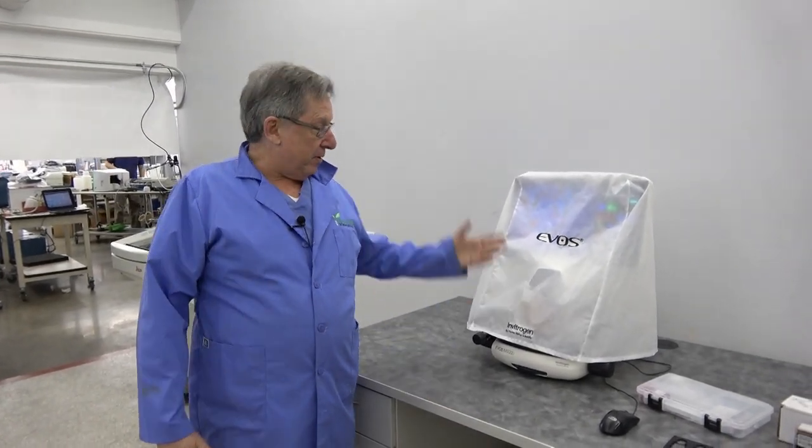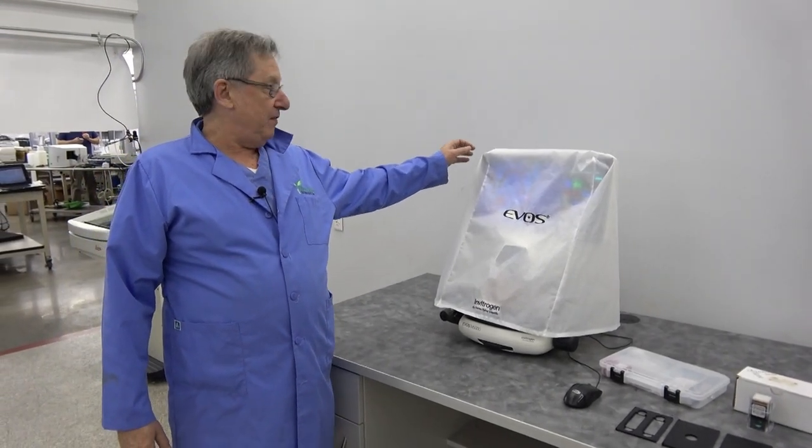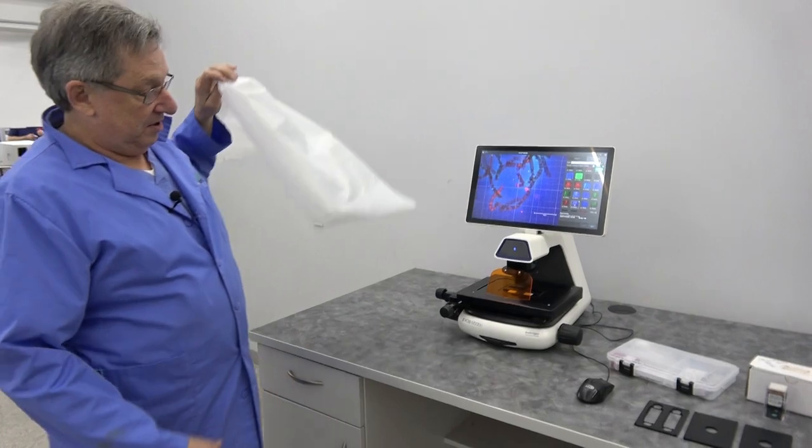Hello! Welcome to New Life Scientific. My name is Steve. Today we're going to show you a little bit about the EVOS M5000 imaging system.